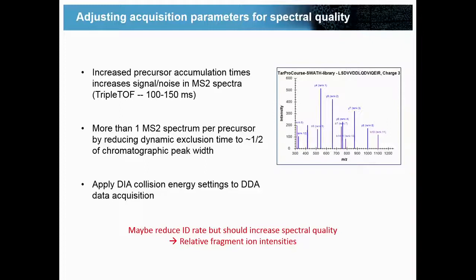There's something known about what the appropriate collision energy is for various peptides in a given charge state. There's some equation that accounts for the mass and the charge state which should give you some kind of optimum fragmentation. And in DDA, you know the charge state. So the machine says, here's a +2 peptide. For example, in DDA, a value of 27 is what we use on the Q-Exactive generally for +2, +3 charge peptides.